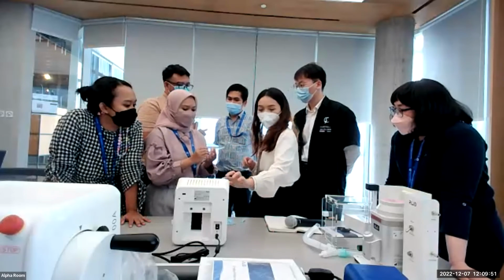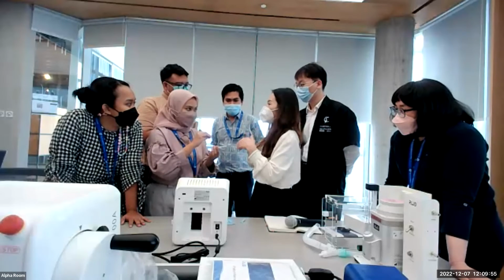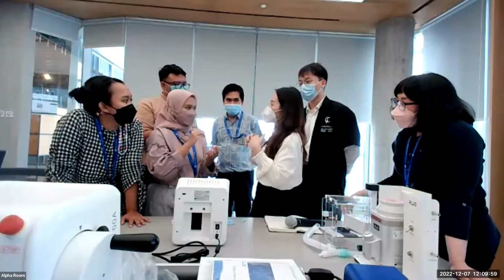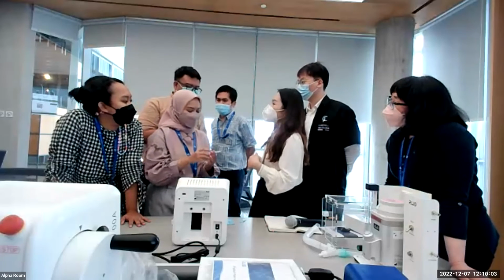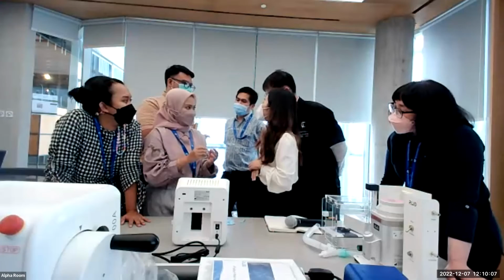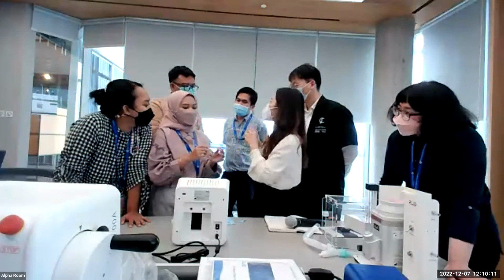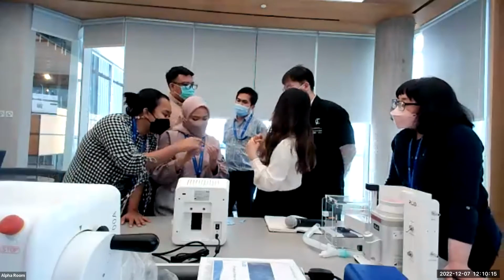No, we should remove the bubble first. They can drop the bubble, and they only count the cell. So if there is a bubble, it's okay. We don't need to remove it, but if you can remove it, that would be better and more accurate.